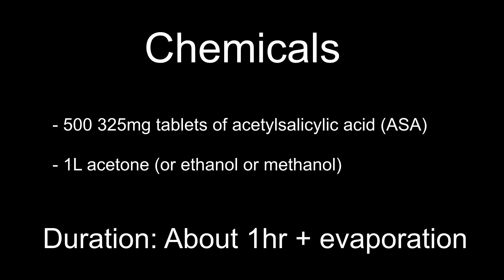I decided to attempt a pretty large extraction using 500 tablets containing 325 mg of aspirin each. To do this, I used a liter of acetone, but you could also use anhydrous ethanol or methanol.